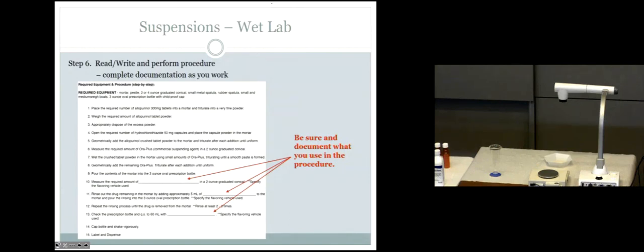One term that we didn't do, can anyone tell me, hopefully you watched the video on how to prepare this. There's one thing that you're going to have to do now that I didn't do in the excess method. What is the key difference between the excess method and the exact method? One word is rinsing or washing. So make sure you understand that you're going to follow through. Just read the procedures. You're having a very important step of rinsing.